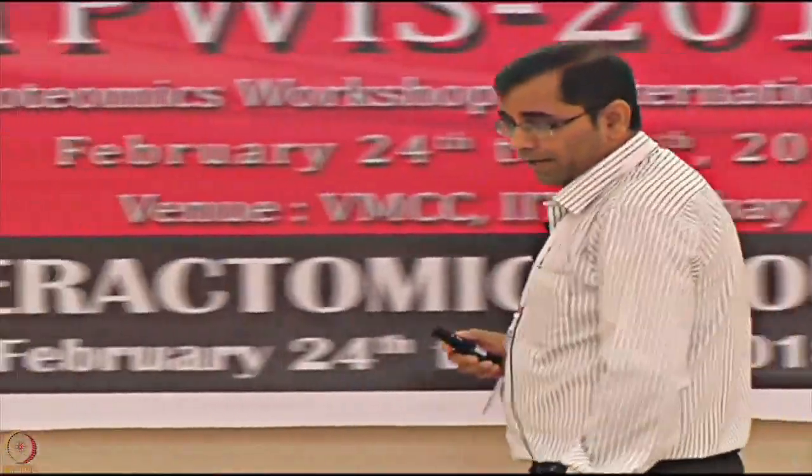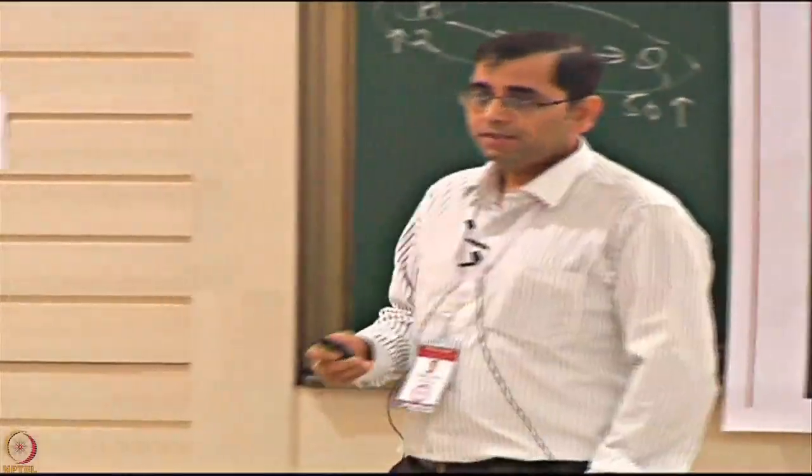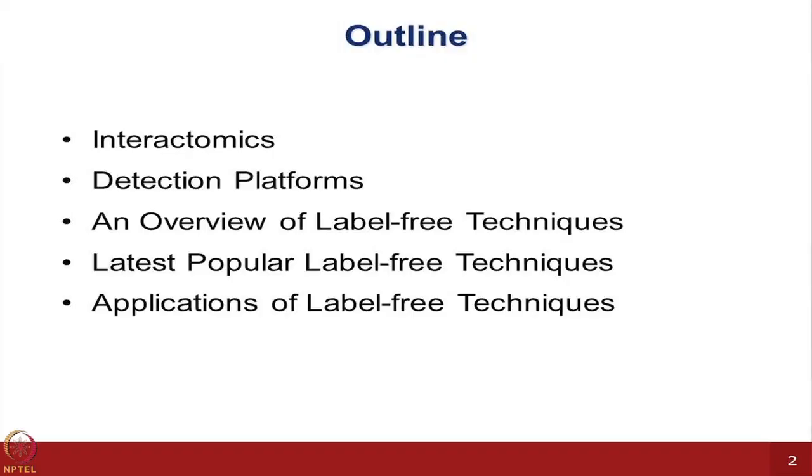Let me start with the outline of what I am going to talk about. A couple of things which you have been hearing already, the field of interactomics. I will not take much time on that, but then I will move to comparing the detection platforms, because you are hearing a lot of lectures from Josh on protein microarrays. You have heard many other speakers on reverse phase arrays and peptide arrays. All of those require some level of label based detection system, and yesterday you also started getting exposed to some of the label free platforms. So, a brief comparison of those two types of detection platforms.